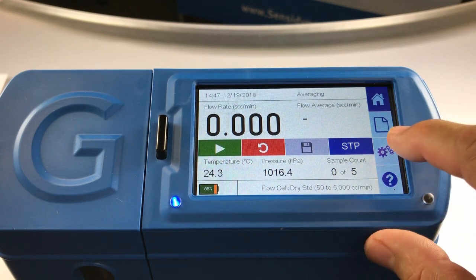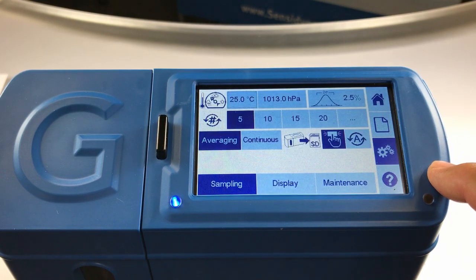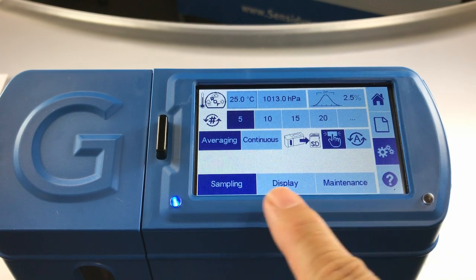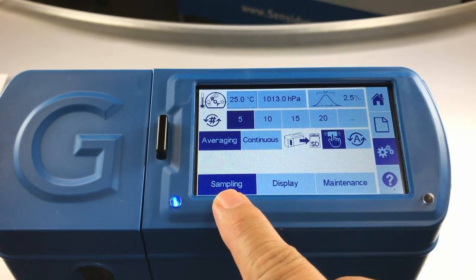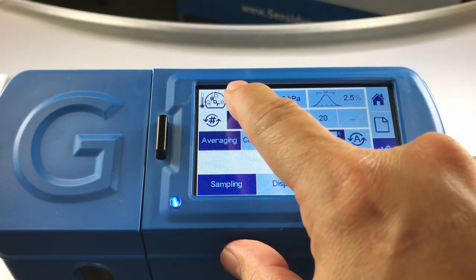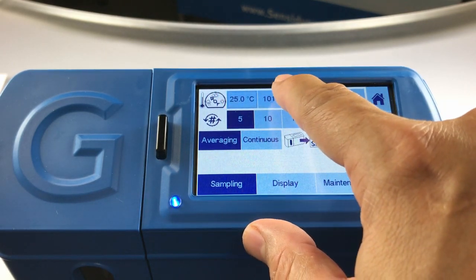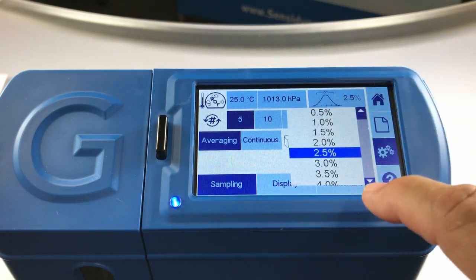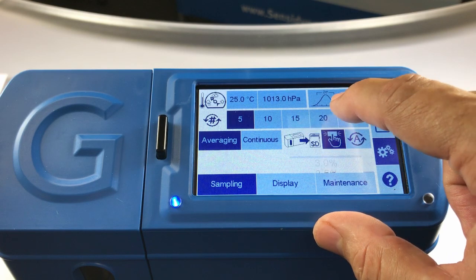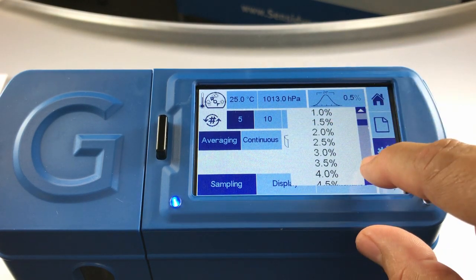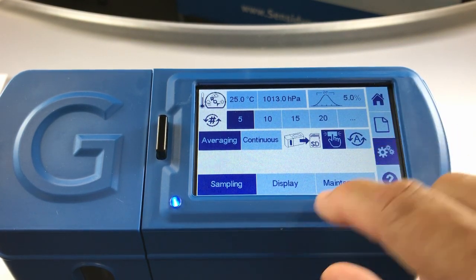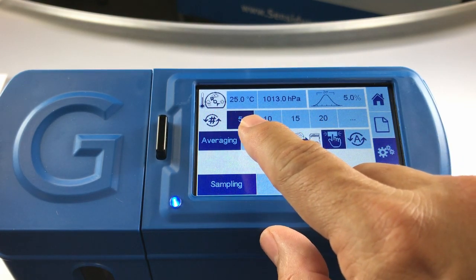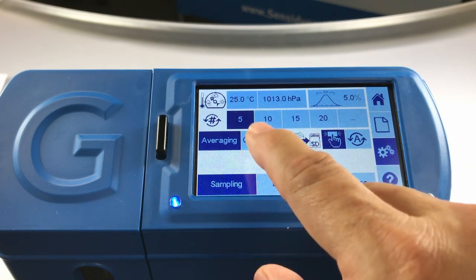To advance to the settings screen, hit the cog button on your menu bar. Once on your settings screen, you'll see three tabs displayed at the bottom. We'll begin with the sampling tab. From the sampling tab, you can choose your reference temperature and pressure by selecting one of the buttons at the top. You may also select your statistical analysis threshold limit value between 0.5% and 5%. You may also select your sample count number — we have already pre-selected 5.